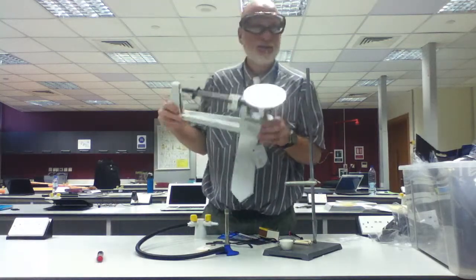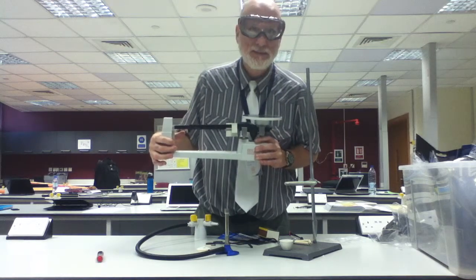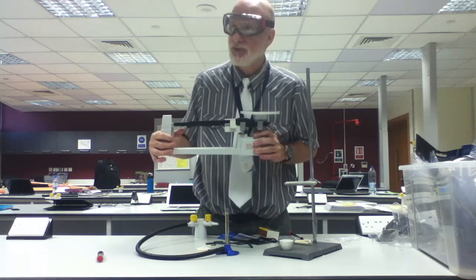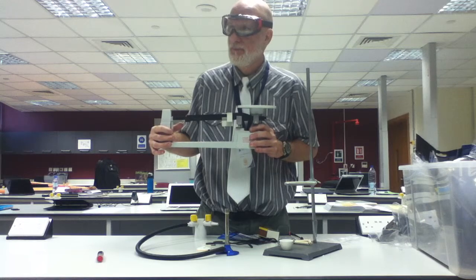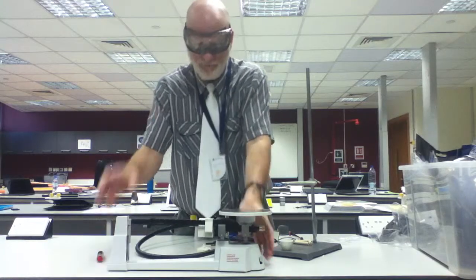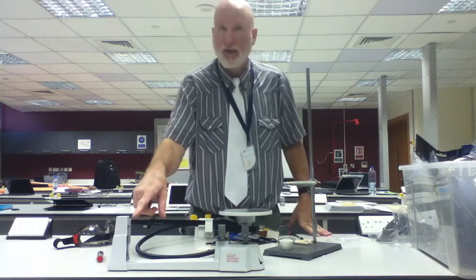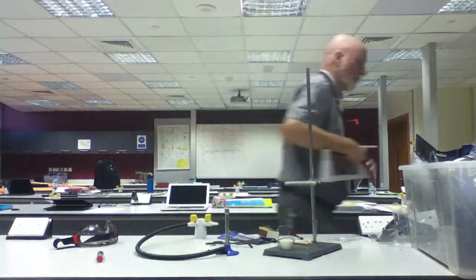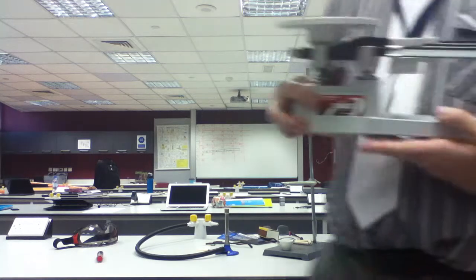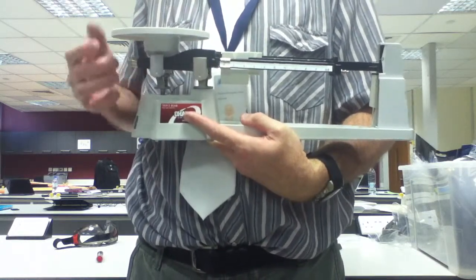Triple beam balance. We don't use electric balances in here. Electric balances are for non-chemistry people who don't care about accuracy and precision. Understood? So this is a balance. The first thing you're going to do is make sure that this is zeroed. How do I zero something? See how that's not zeroed? It has to be heavier.